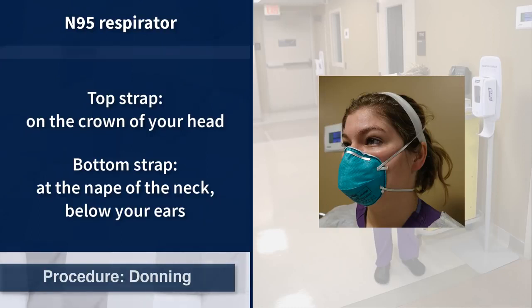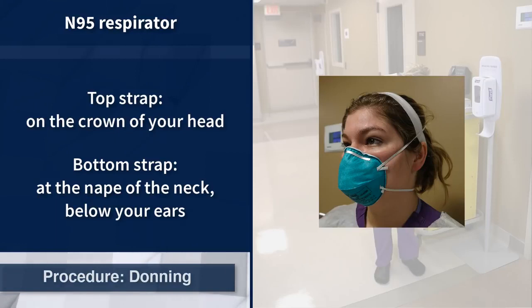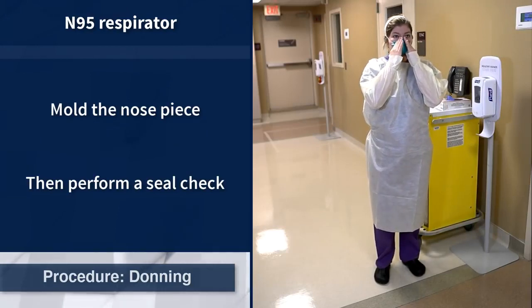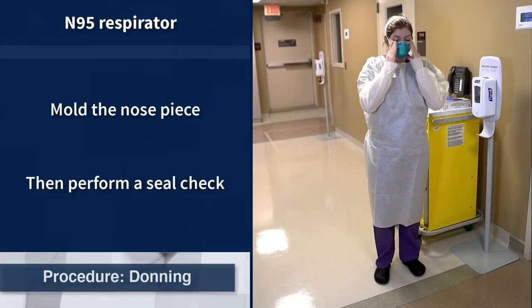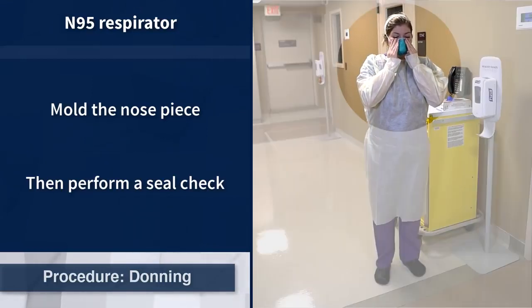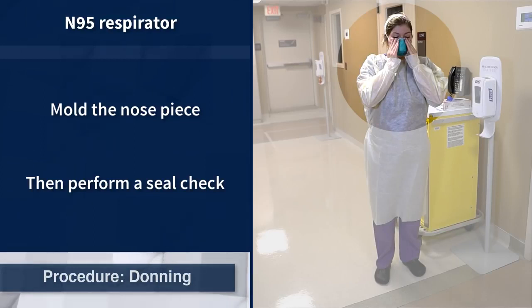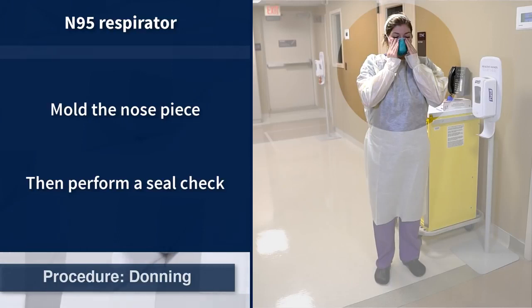There are two straps on the N95 respirator. The proper placement of the top strap is on the crown of the head while the bottom strap sits at the nape of the neck below the ears. Do not crisscross the straps. Once the N95 respirator is in place, the nose piece should be gently molded to the bridge of the nose and a seal check performed by inhaling and exhaling quickly while using fingers to feel for air leaks around the edges of the mask. If air is escaping around the nose, remold the nose piece and repeat the seal check. If air escapes from the sides or bottom of the respirator, readjust the respirator and repeat the seal check until no air leaks are found.